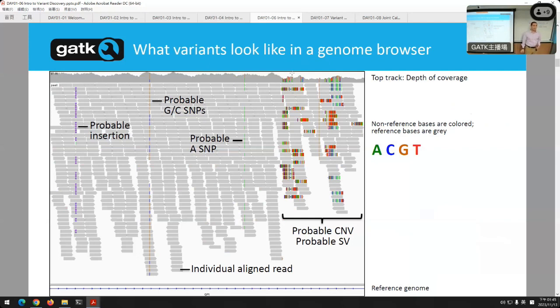And if I mentioned those Q2s, where the ends of the reads are not high quality, that Q2 process happens randomly. But in this picture, you see they're all happening at the very similar or same position. So that's no longer random, and there's usually some signal there. And that signal is used to find much larger things hidden in the DNA.